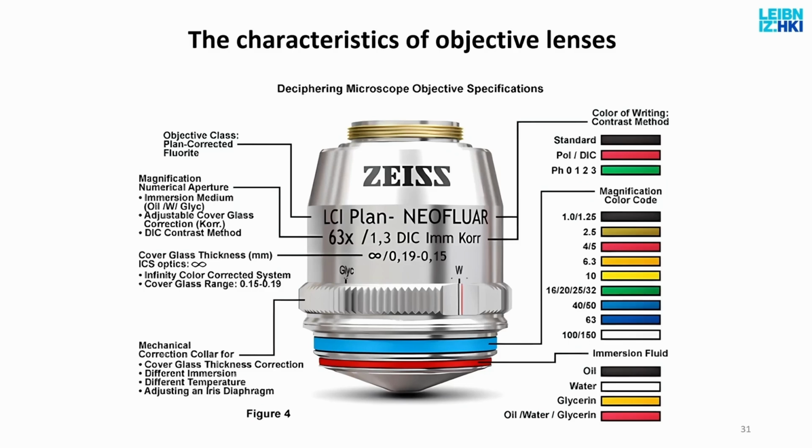No. Why? Because the microscope contains a second lens. You saw this when we marked it as the ocular. This is the lens that you look through. This adds an additional, typically 10x, magnification. So when I have a 63x objective lens and a 10x ocular lens through which I look, then my total magnification will be the multiplication, so 630. Now that makes sense. Then 1 micron will look like half a millimeter, and then I can work with that. I can put this on a camera, take a picture of it, and then I can analyze.